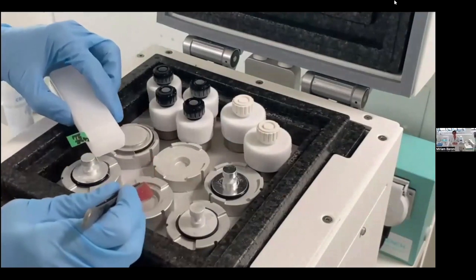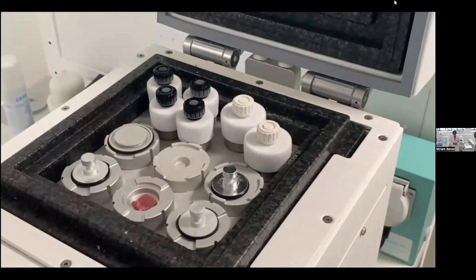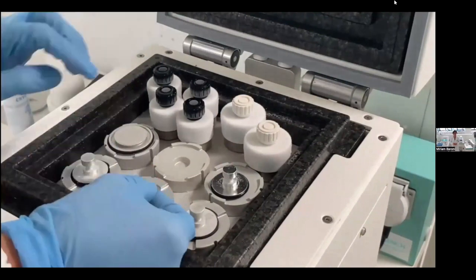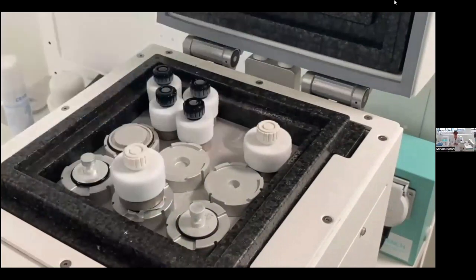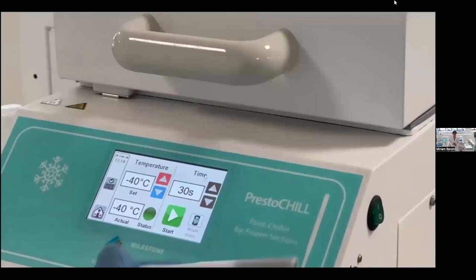Now I use the spatula to move the sample to the center of the mold. At this point I can fill the mold with the medium, and if I want, I can add an identification tag to the block. I then put the chuck that comes from the cryostat — a structure that enhances and speeds up the freezing of the block.